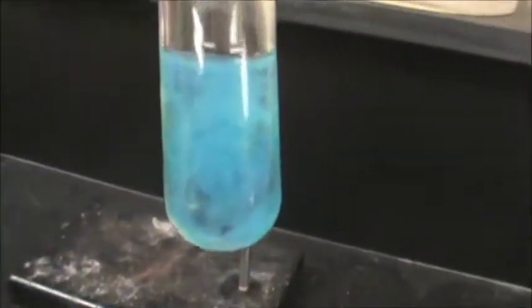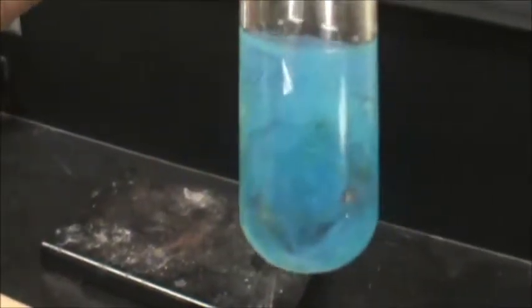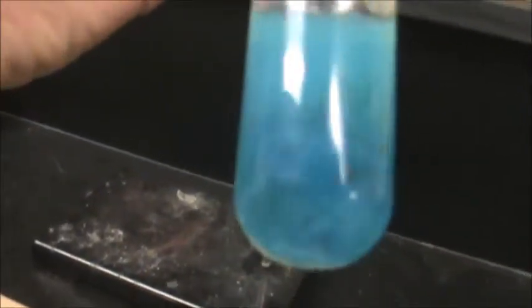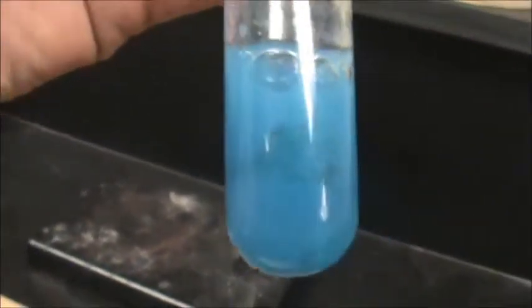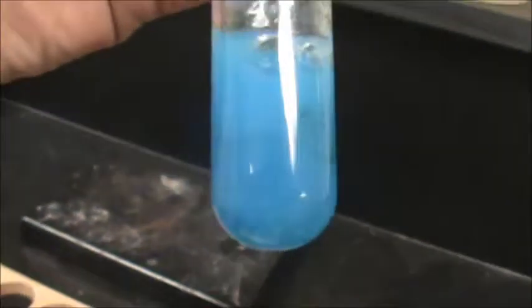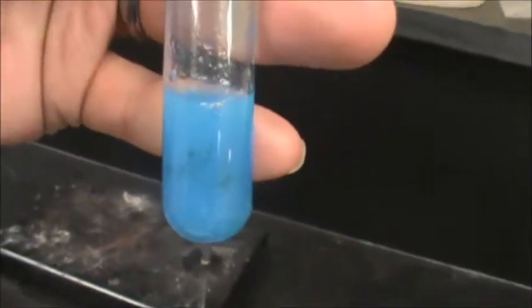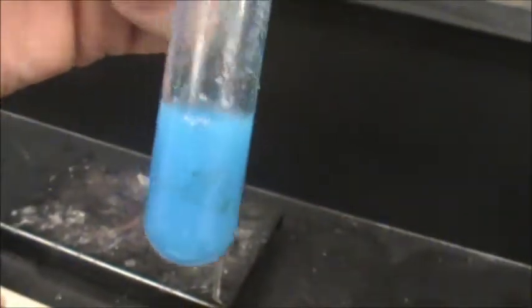I bring my test tube up, you look closely at it. Let me shake a little bit. It looks almost like you have solid particles sitting in there. I don't notice any temperature change, and actually if I shake it up a little bit more, mix it all up, it's got a nice blue color to it, and it actually kind of looks like a blue gel that formed. It's thick. It doesn't look like that clear water. You can see it's completely opaque. You can't see right through it like the copper 2 chloride. So we got a number of observations that are going on here.